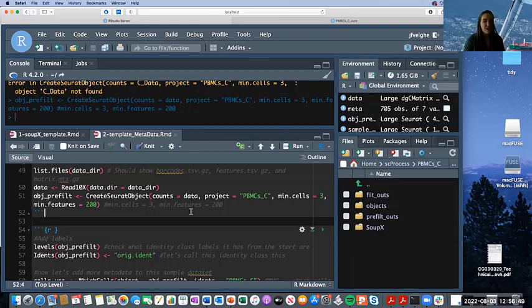You could, and that's where these parameters, and this is going to be my big thing for this section, are all of course tweakable. Don't just assume because I did it or a tutorial did it or a vignette did it that this is the set standard. It's really going to depend on what you're expecting to see in your data, what you know about the biology and what you're looking for. So it's almost like a craft when it comes to filtering and thresholding your single cell RNA sequencing data, because you do have to consider the biology a little bit.